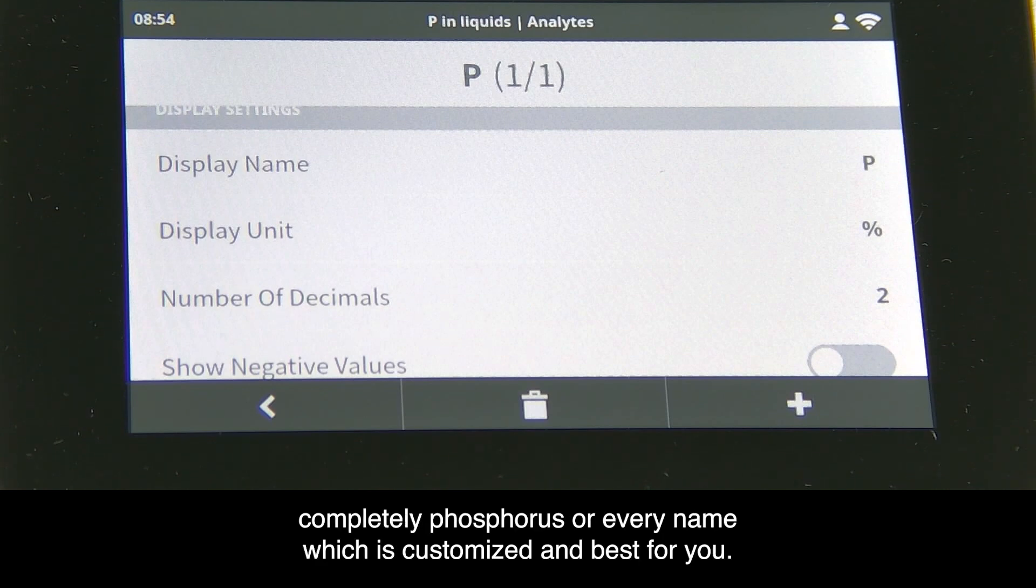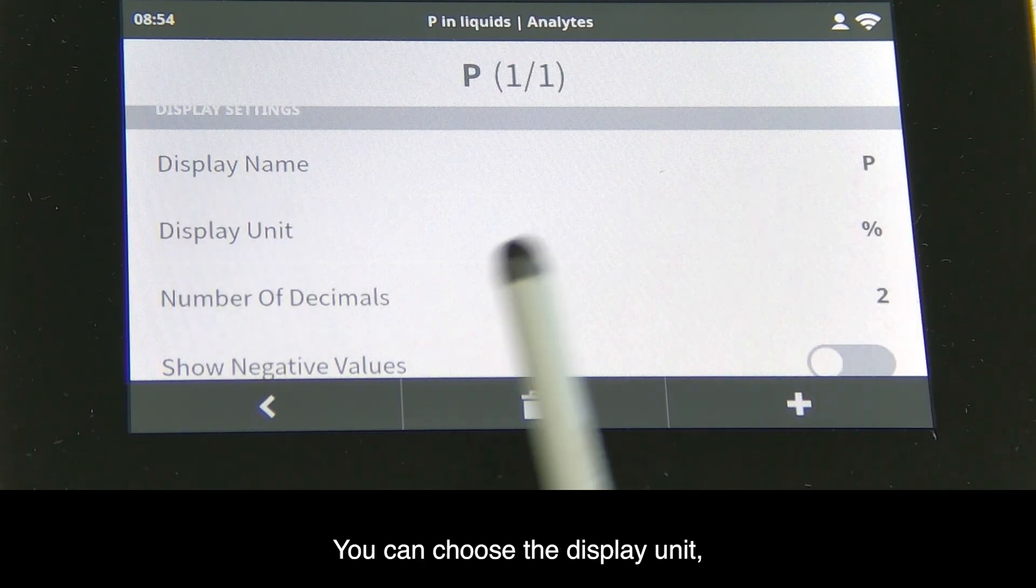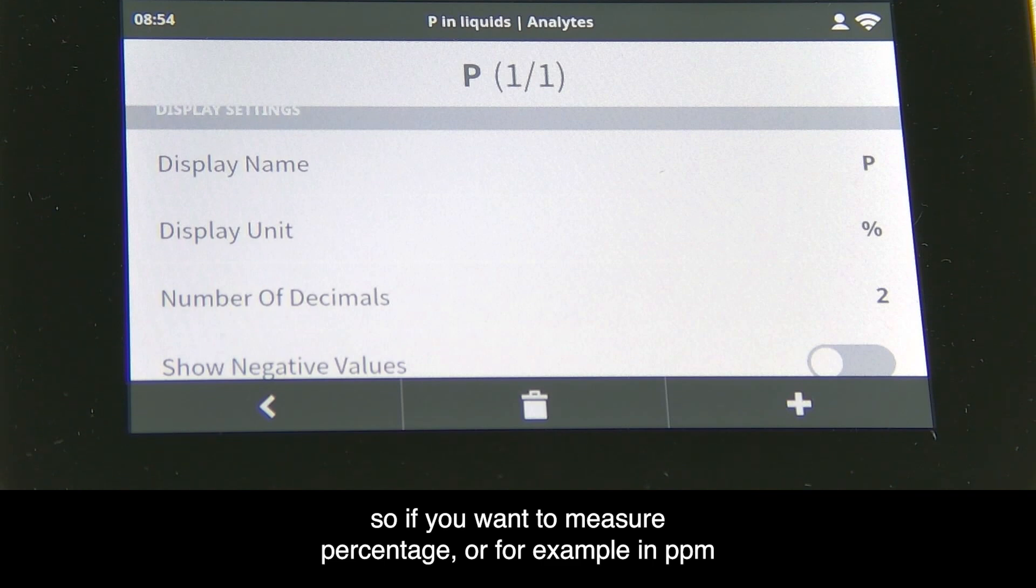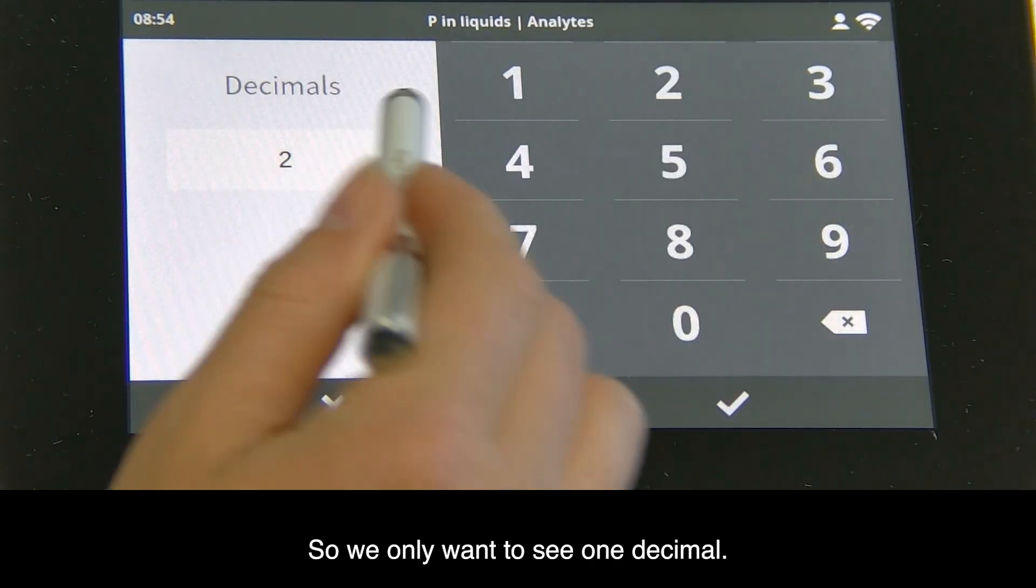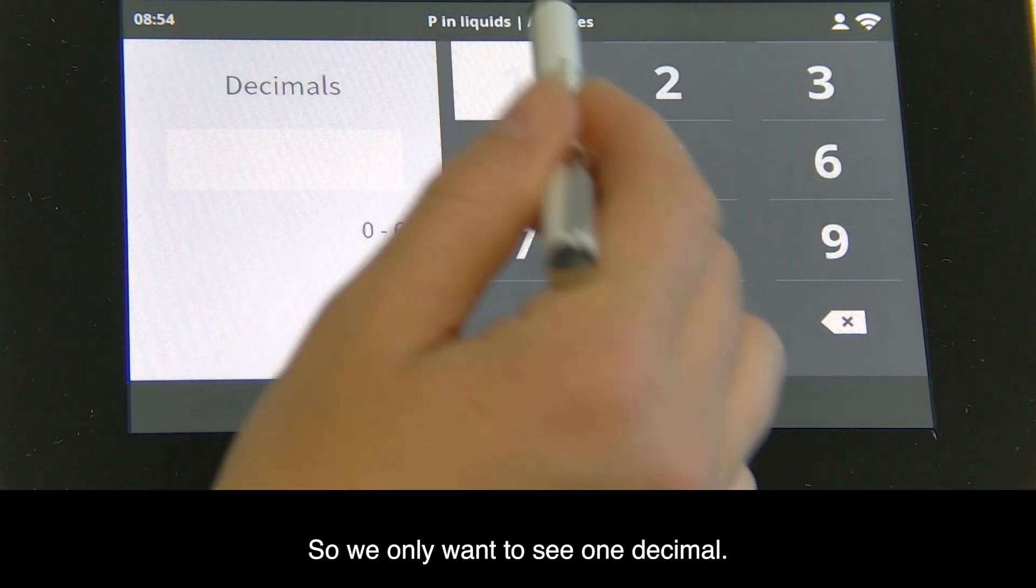You can see only the P or enter the name completely as phosphorus, or any customized name. You can choose the display unit - percentage or ppm - and enter the number of decimals. We only want one decimal.